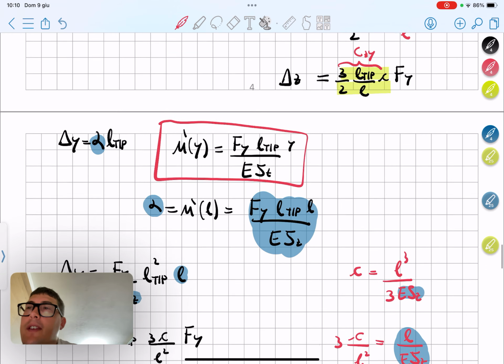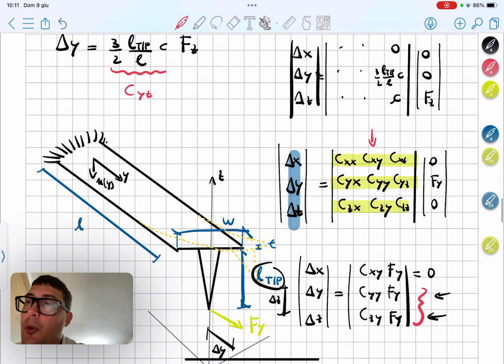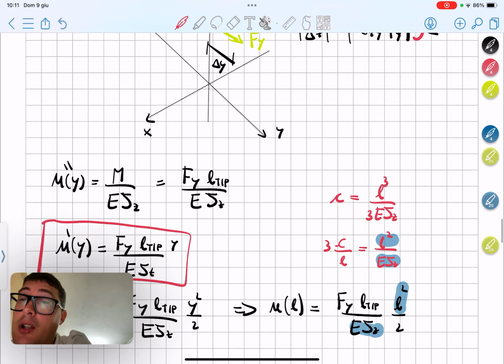So from a magnitude perspective, the CZZ is the biggest and the others are all smaller. So the delta z direction is so much bigger than the others. And some of them we could consider negligible, but in any case, we calculate all of them.